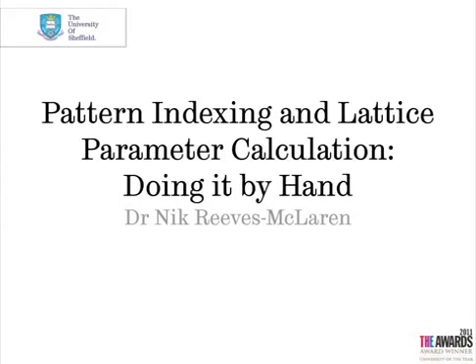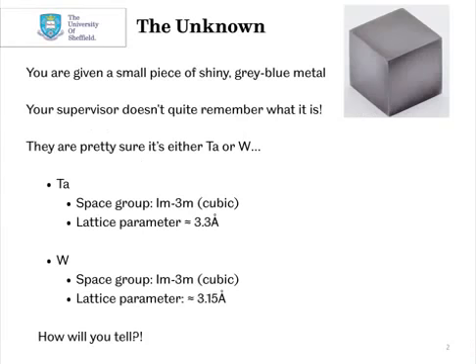In this video, I'm going to show you how we can index a powder pattern by hand and then calculate the lattice parameters. We're going to do this for an unknown material. Let's imagine you've been given a small chunk of shiny metal and your supervisor doesn't quite remember what it is.